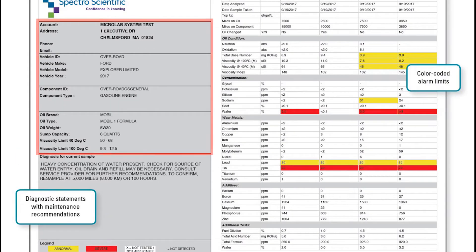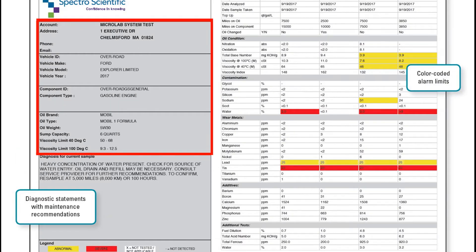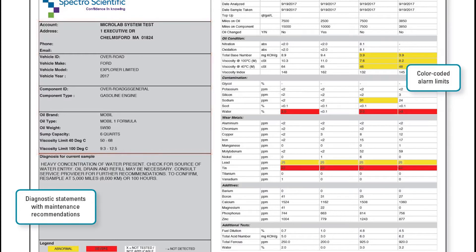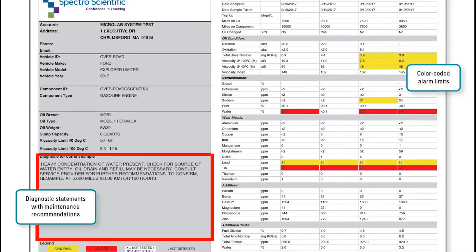On the left-hand column is the information about the equipment and the oil being tested. Below that are the diagnostic statements for the current sample, directing the mechanic on what maintenance action they should consider taking.